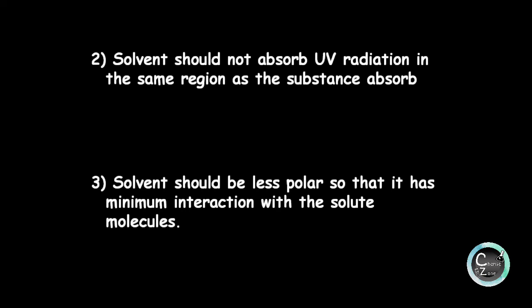The third criteria is the solvent should be less polar so that it has minimum interaction with the solute molecules. If the solvent is a non-polar solvent, then it will not form hydrogen bonding with the solutes. Therefore, we will get a fine spectrum.